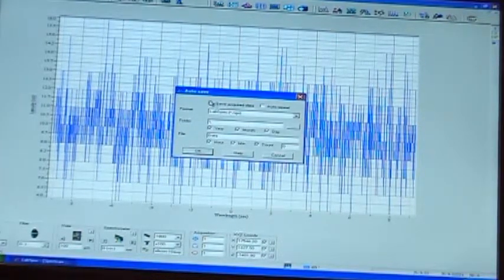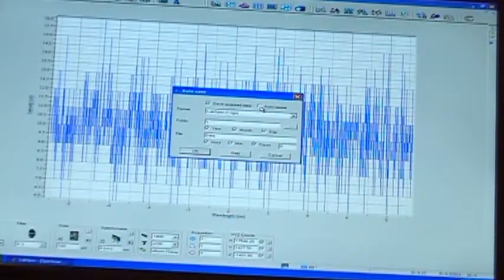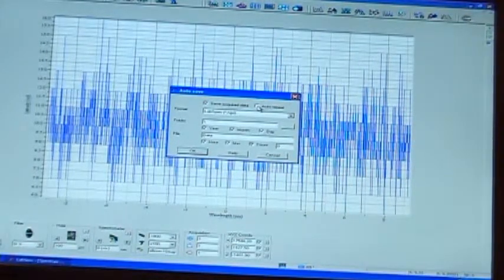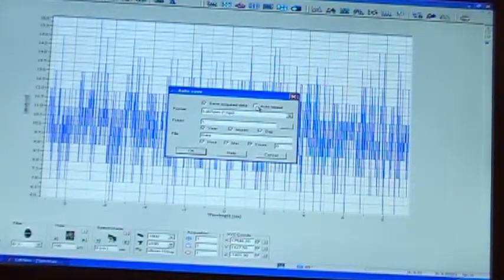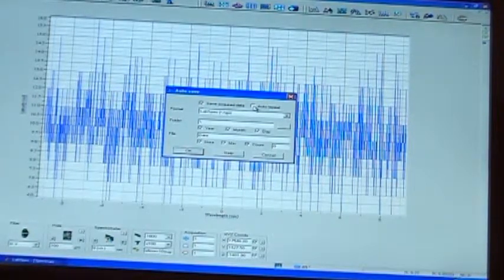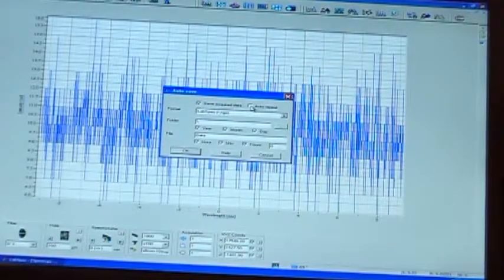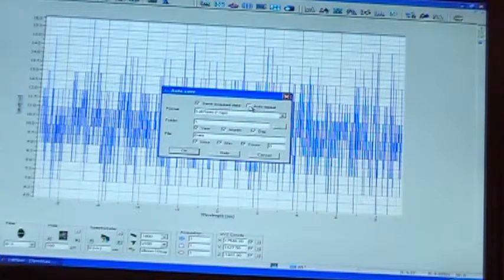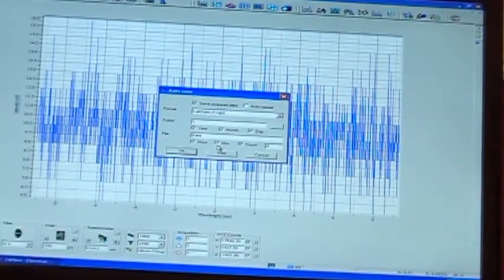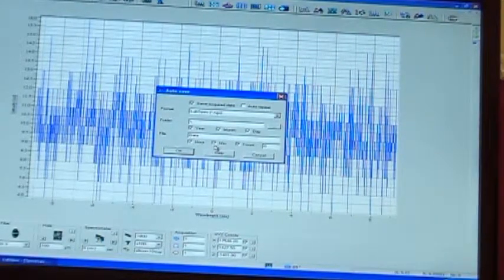And then if you want, you can even set it up here to repeat. For example, if you've got your heating and cooling stage here and you're running it through the course of the night, raising your temperature by 5 degrees every 5 minutes, you can do a 5-minute acquisition, then it'll auto-save, and then you can set up auto-repeat, and it'll repeat it again. And then down here in the option, it'll save the hour, the minute, and tell you the time that each data point was collected. So then you can open them individually and plot them through the course of time.